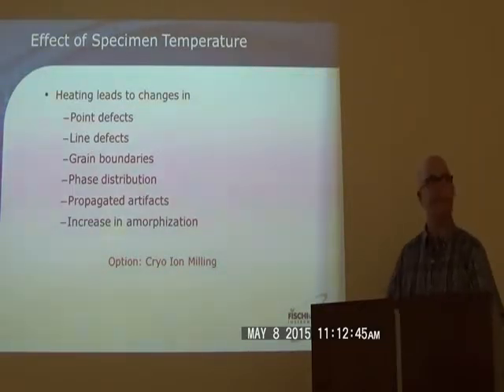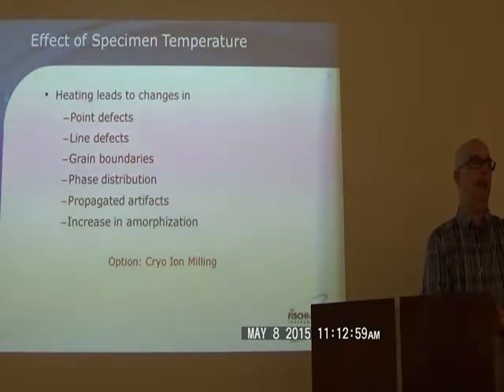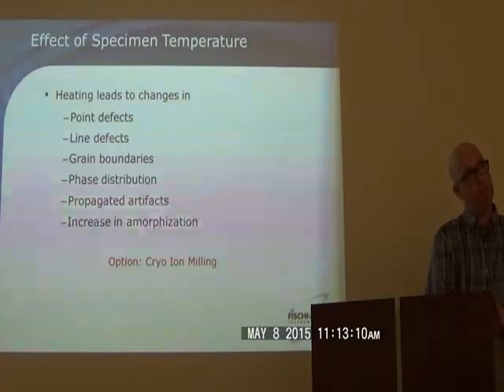So, Rocco, I have a question. When you are hitting the surface with the ion, are you also ionizing the very few nanometer surface layer? Yes, you're breaking bonds. The atoms are bonded, and basically you have a neutral species in the material. But when you are talking about point defects, you are taking out electrons from somewhere. Yes, well, you've broken a bond.